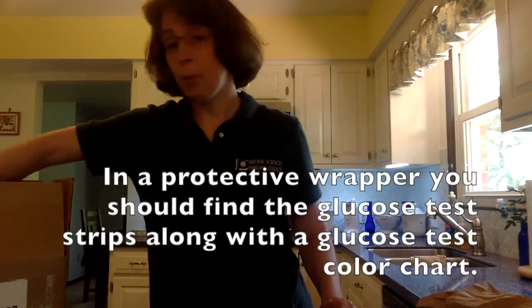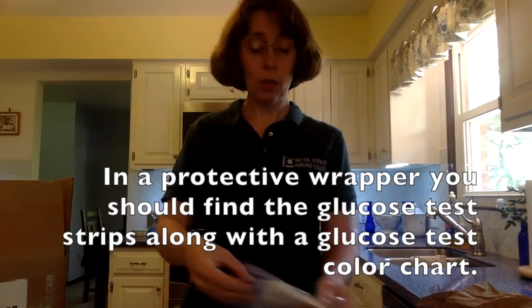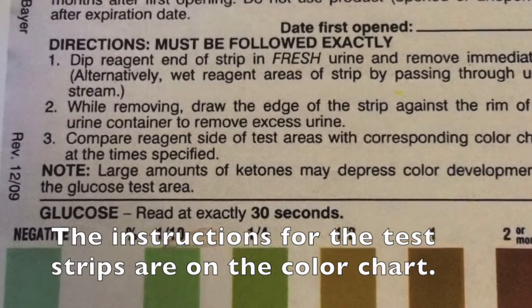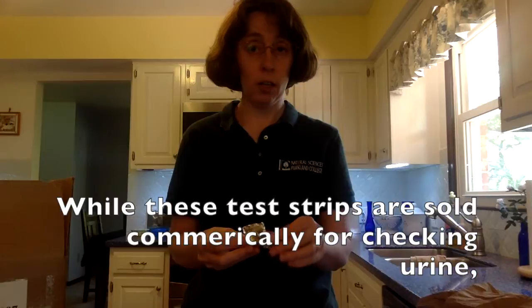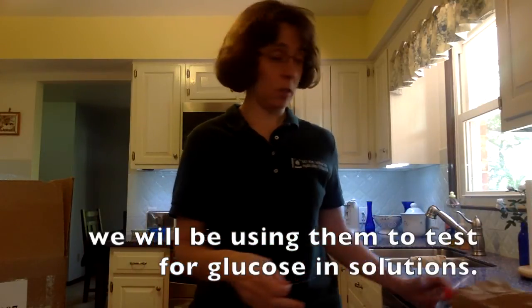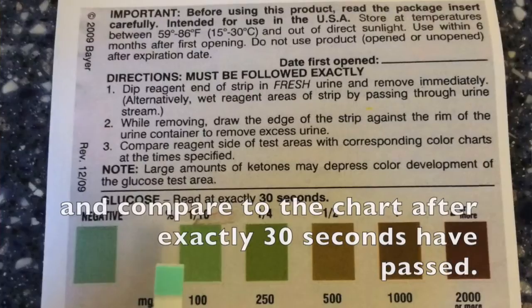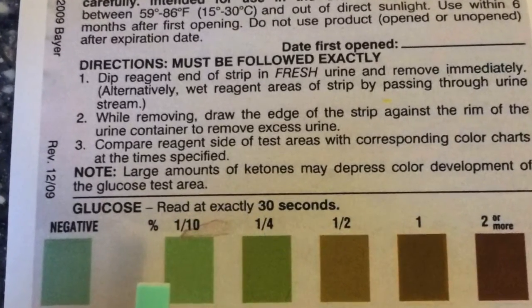In a protective wrapper, you should find the glucose test strips along with a glucose color chart. The instructions for the test strips are on the color chart. While these test strips are sold commercially for checking urine, we will be using them to check for glucose in solutions. So just follow the directions: dip, draw, and compare to the chart after exactly 30 seconds have passed.